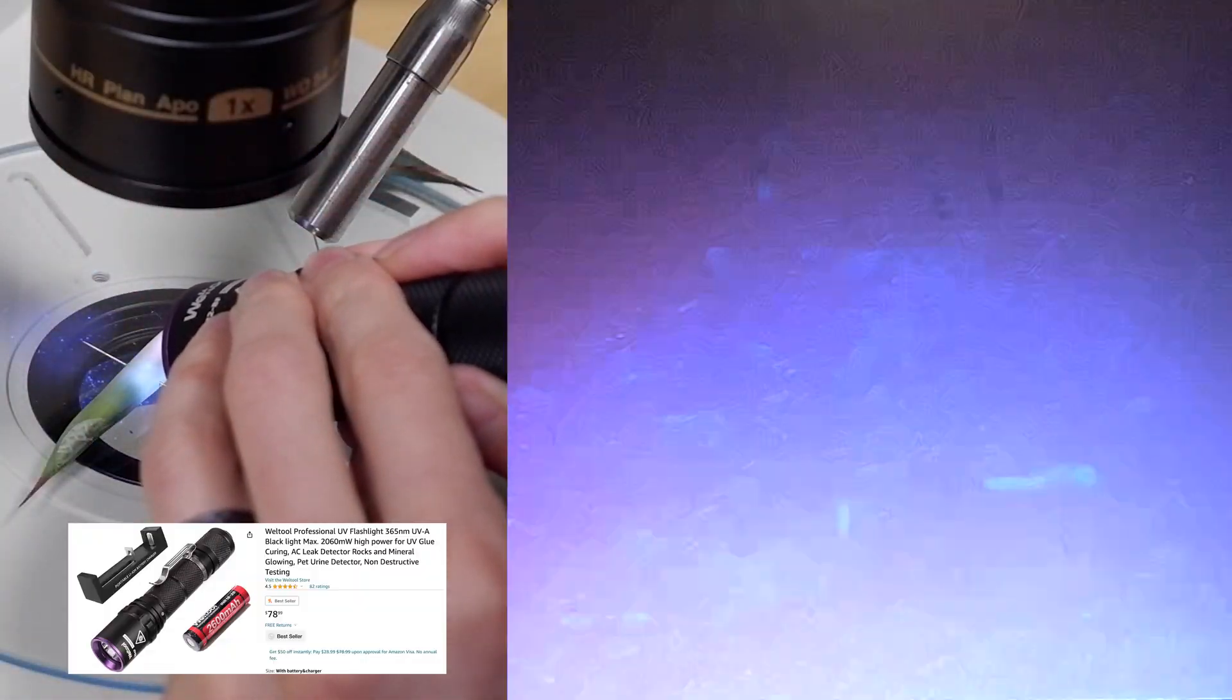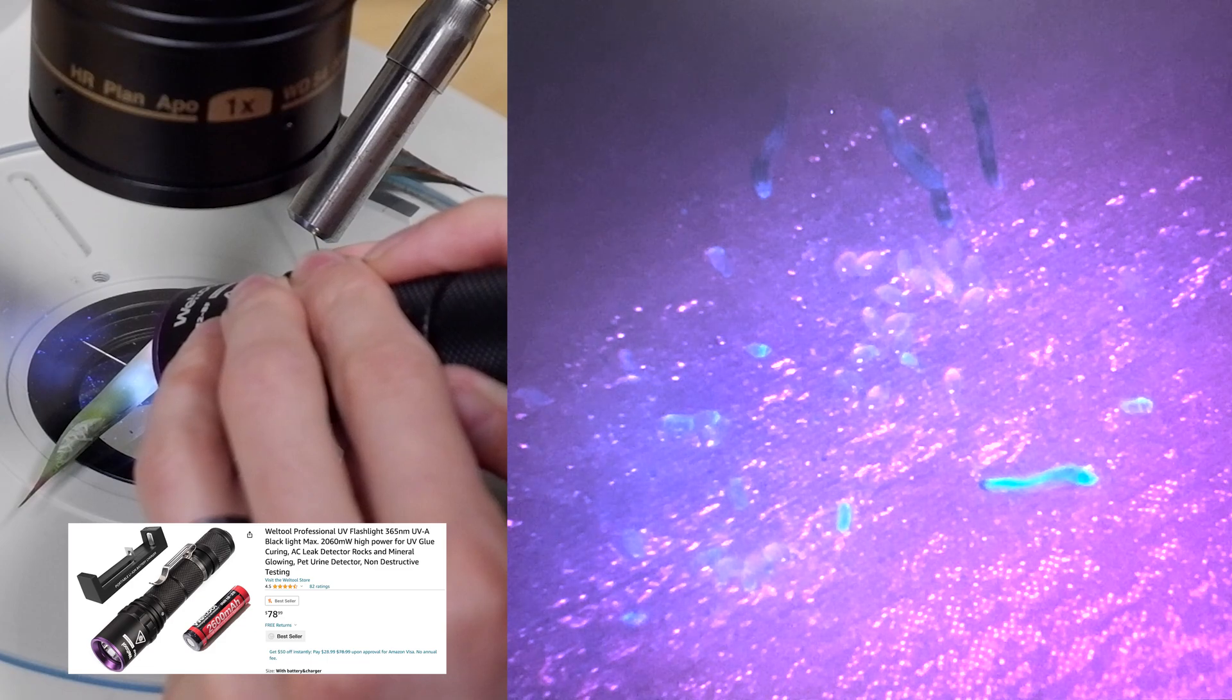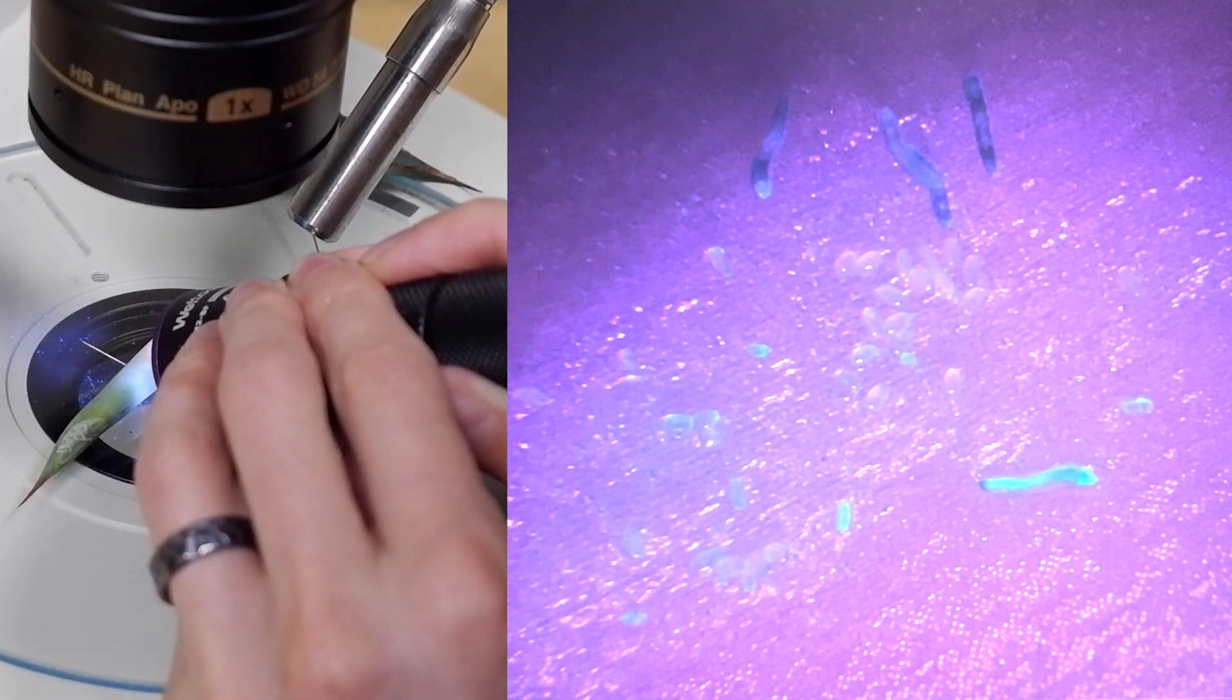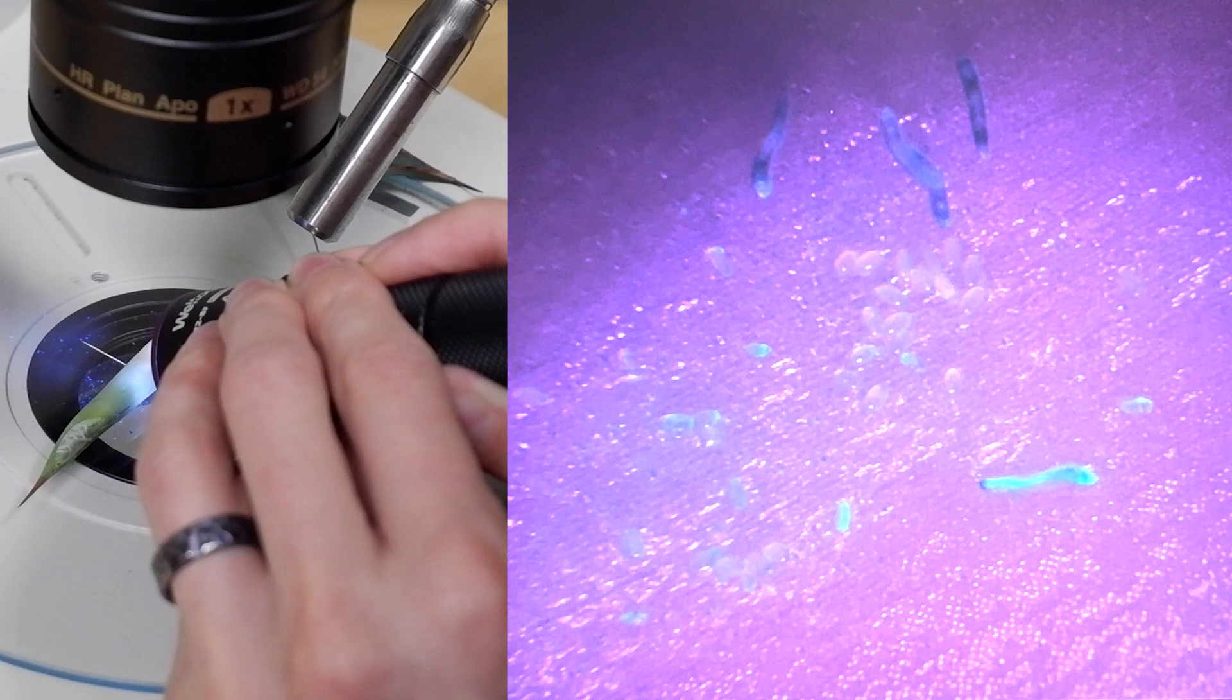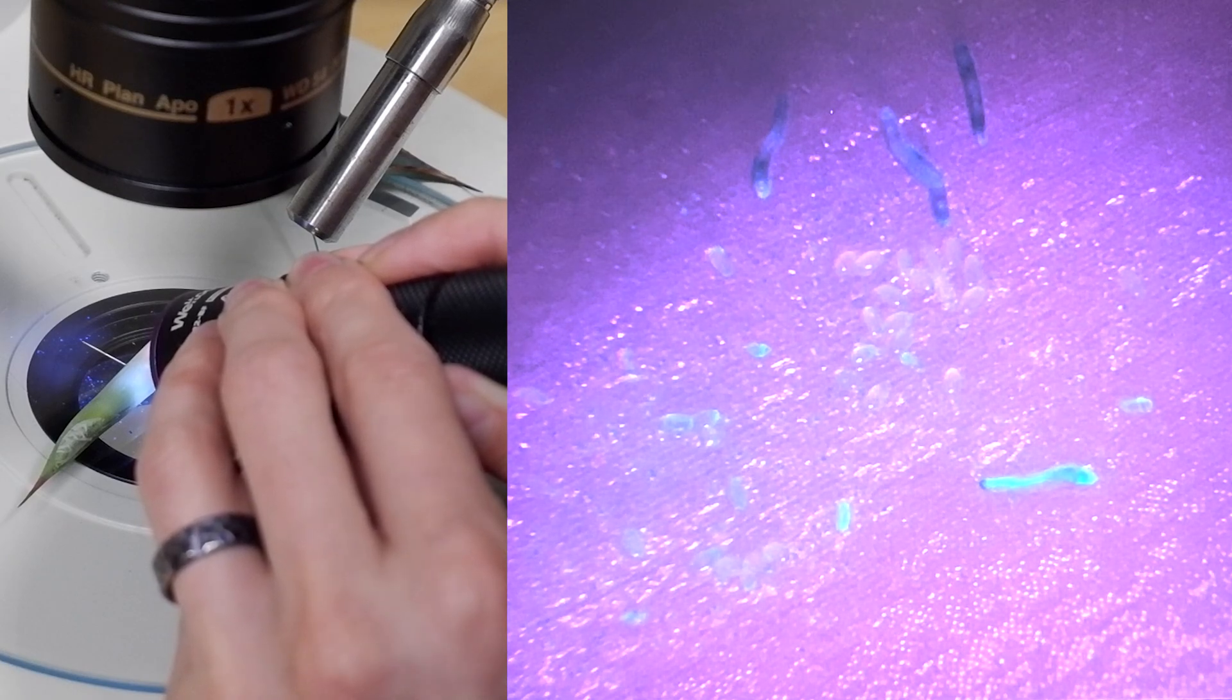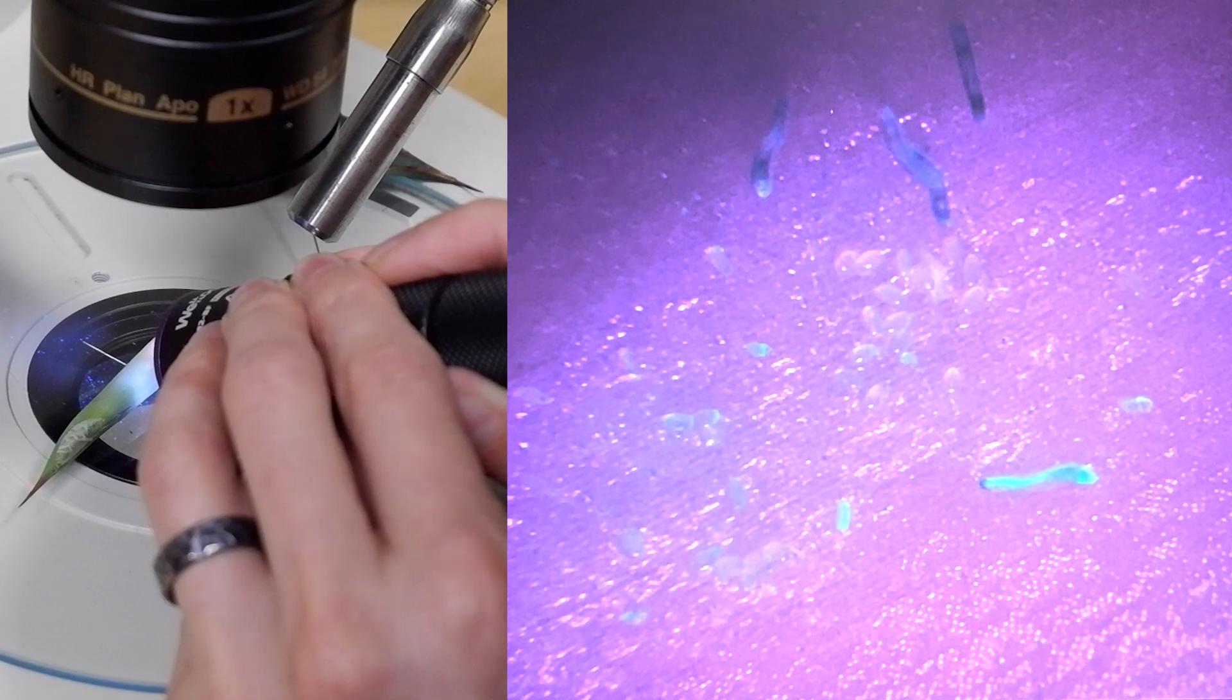And then the last one is the one I usually use the most, which is the Well Tool. This seems to have the most contrast where you can see the mites very clearly and you can also see all of the eggs quite clearly as well. So this is a really good example of the different lights and how the ones that illuminate everything evenly aren't as effective as the ones that illuminate things selectively.